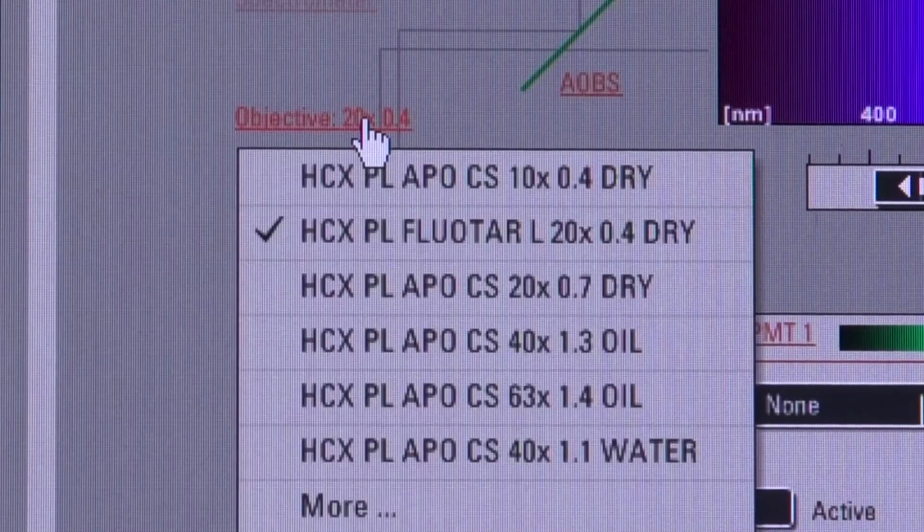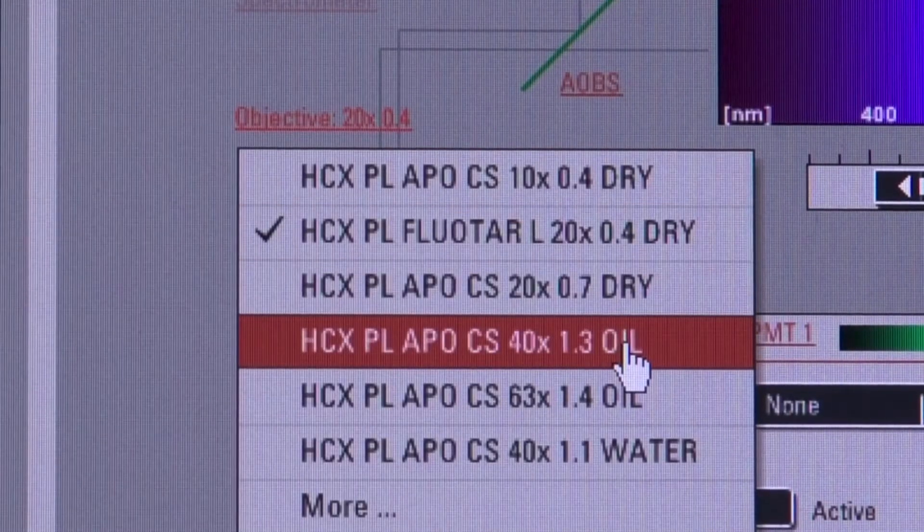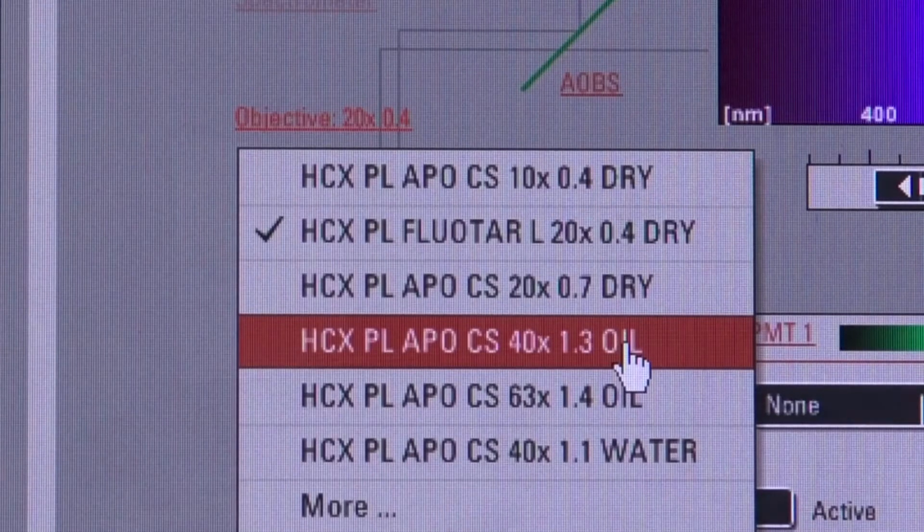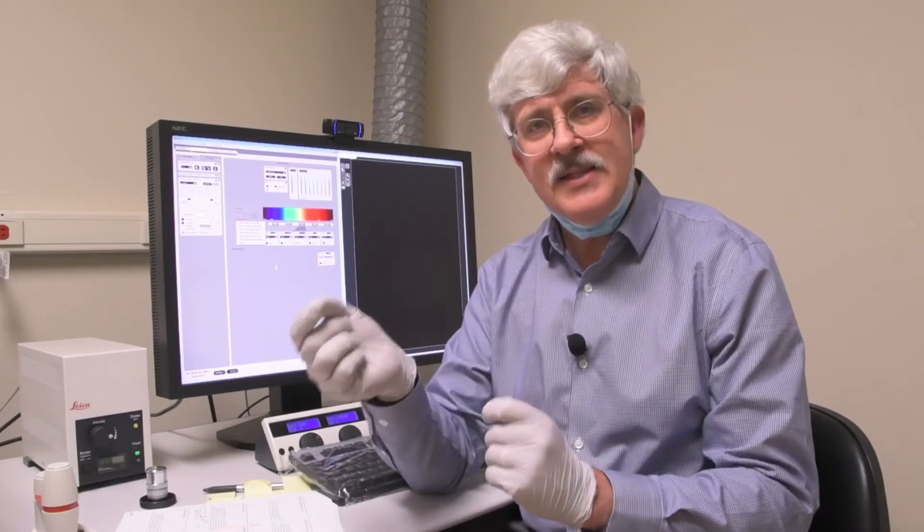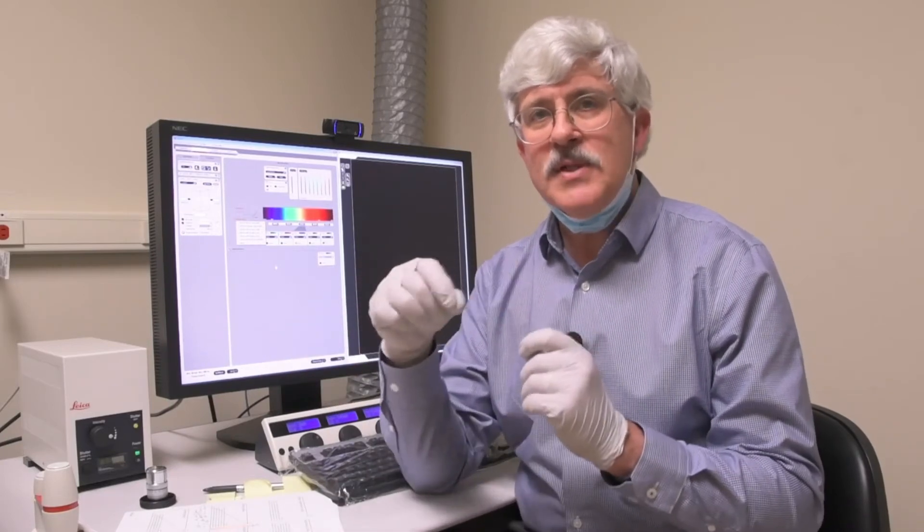Let's take a look at the next lens on the list. This is the 40X 1.3 NA oil objective. The numerical aperture depends on the refractive index of the material that the light is traveling through, with air being the default and a refractive index of 1. So any objective that we see that has an NA less than 1 has got to be a dry lens. Anything that's got an NA higher than 1 is some sort of an immersion. If we have immersion objectives on our microscope, we have to be very careful that we don't get some of that fluid onto the dry lenses. If we do, we'll have to clean off those objectives before we can use it. Because if you have oil or water or glycerin on a dry lens, it's just going to make everything blurry.